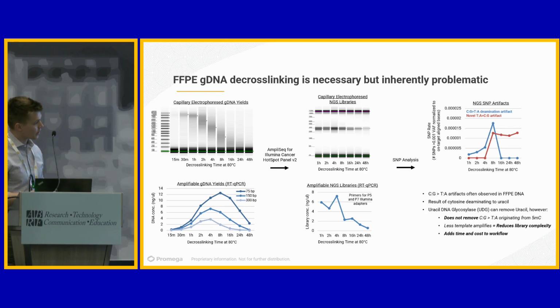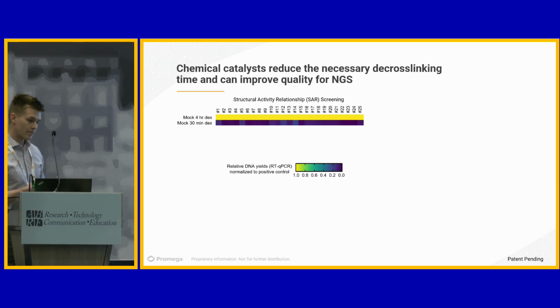So we were very motivated to reduce the necessary decrosslinking time for FFPE. So we initiated a chemical screen. What I'm showing you here is amplifiable DNA yields.